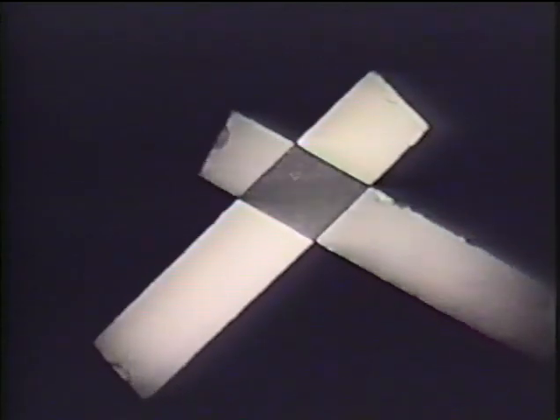Let us look at these effects as they are produced by a thin layer of mica between crossed polars. We superimpose two pieces, one above the other. The upper layer reinforces the effect of the lower, making the double layer brighter. Now, we turn the upper layer through 90 degrees in its own plane. This brings it to the compensating position. The overlapping area is now completely dark, one layer having exactly compensated the effect of the other.